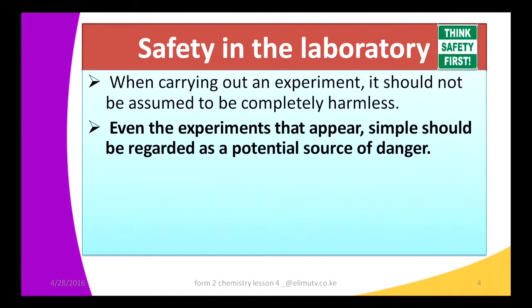You have to do it with a lot of caution and be very careful, so that it may be one of the potential sources of danger within the lab. Just a simple demonstration can cause an accident in the lab, so that one has to be noted.